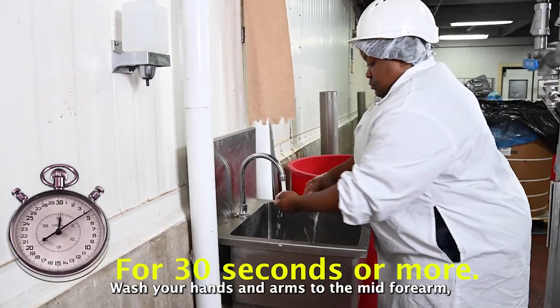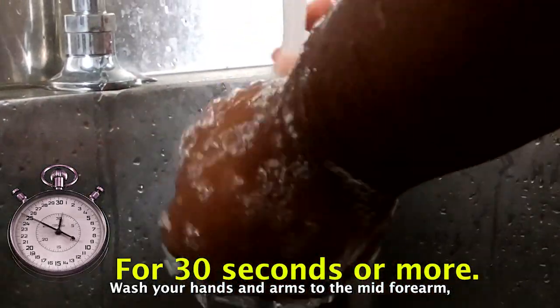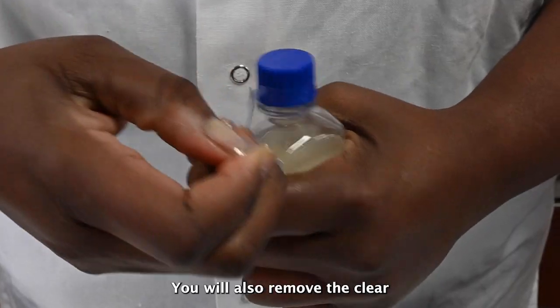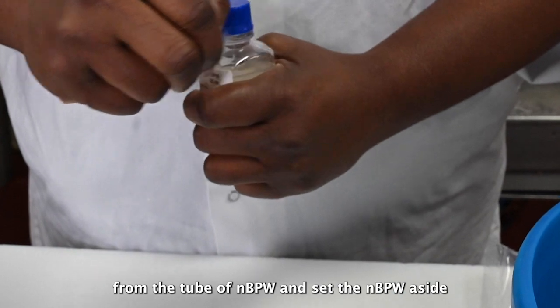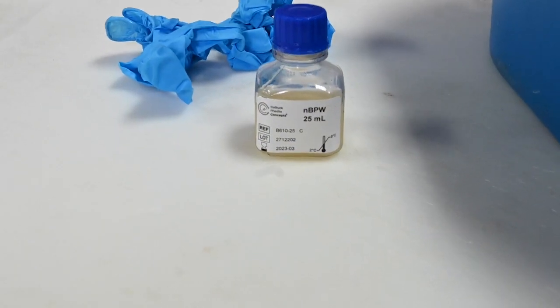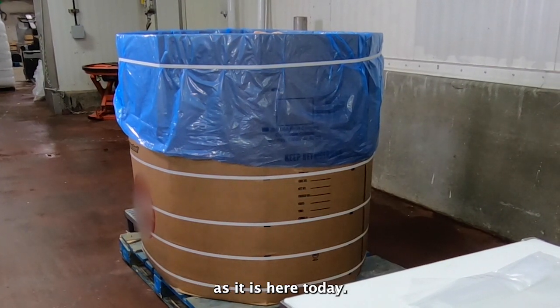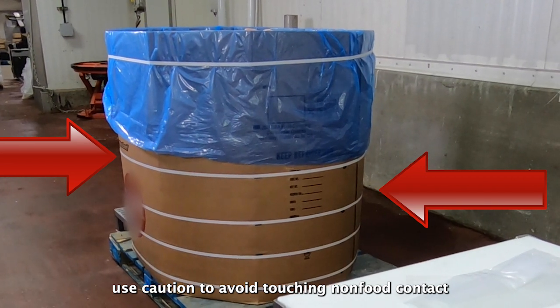Wash your hands and arms to the mid-forearm. Then prepare your sample supplies by removing the sleeves and gloves from their packaging. You will also remove the clear, perforated plastic shrink wrap from the tube of NBPW and set the NBPW aside for use later. The product selected for sampling may be exposed and ready for sampling by the establishment, but if you need to expose the product, use caution to avoid touching non-food contact surfaces.